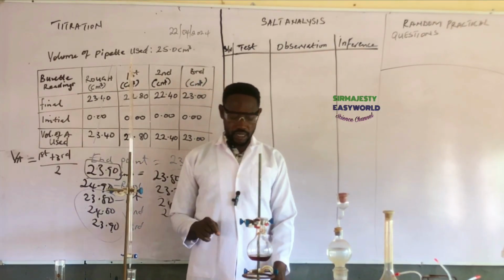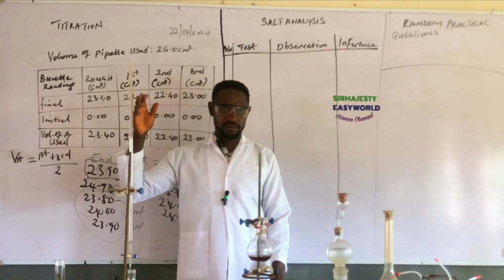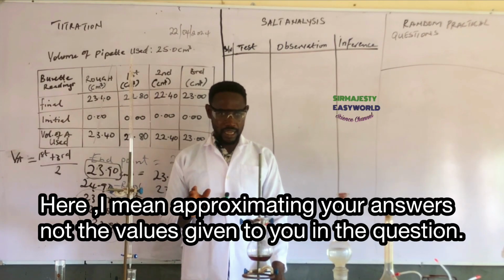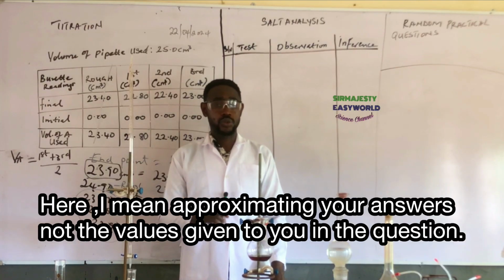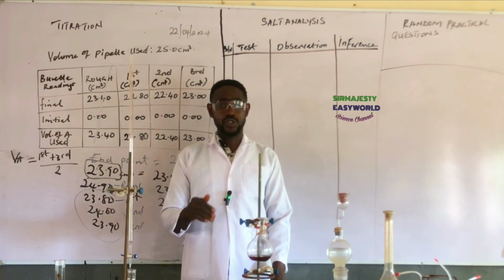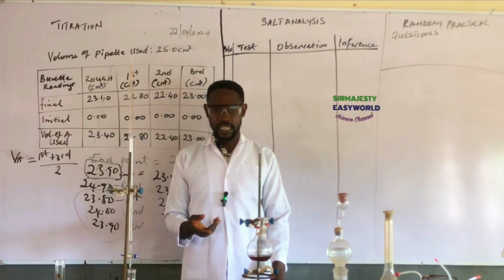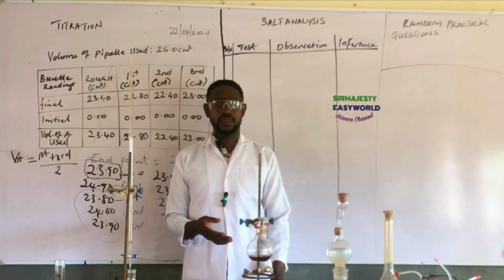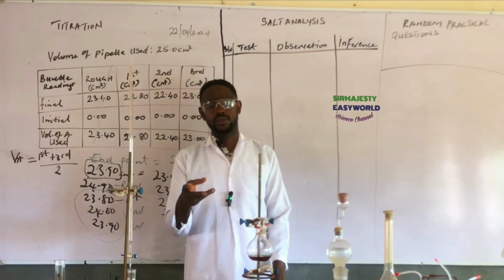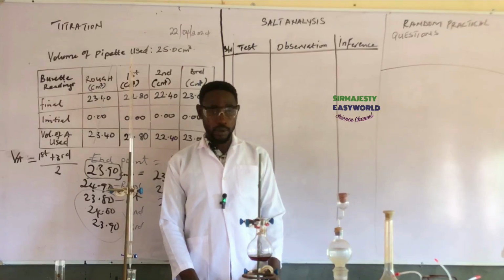From my experience, the only time you're allowed to approximate is if it's up to 8 or 9. Because if you ever approximate 0.15 to 0.2, my dear, the molar mass you're supposed to get as 40 might multiply by 80 or become divided to get 20. So you can only approximate 0.1819 to become 0.2, and you still fall within the range. I know this is going against your normal mathematics.